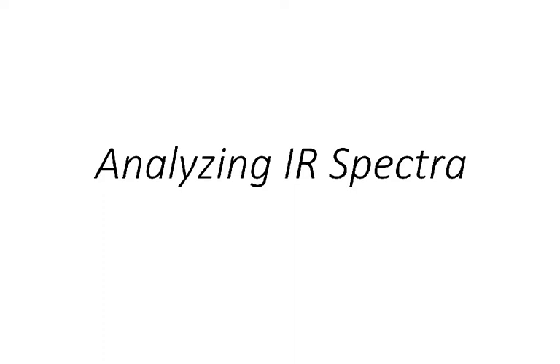Now, there aren't really any hard and fast rules about analyzing IR spectra, and I'm not trying to assign every little peak. Instead, what I'm looking for is general recognizable patterns. Originally, I was going to have some example problems along with the patterns that I look for, and I decided to split that into two videos. So in this video, I'm going to share with you the patterns that I look for, and then I've got a third video where we look at some specific examples that are going to be pretty similar to what I might ask on a quiz or a test.